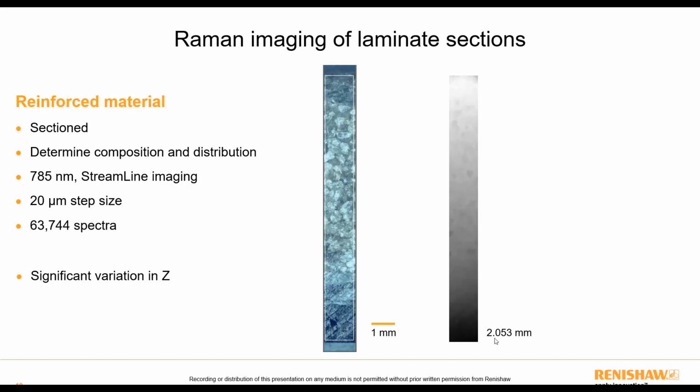It's actually showing quite a big variation of about 2 millimeters. You can see that actually this is mostly because of a slope. So at the top it's lighter and at the bottom it's darker. So this whole sample slopes slightly. But even on top of that, you can see some of the features that correlate to different parts of our sample itself. And of course, you kind of expect that even from something that's been polished, because some materials are going to be worn away more quickly, and so you're going to get these subtle variations in your height depending on what the material is at different positions.